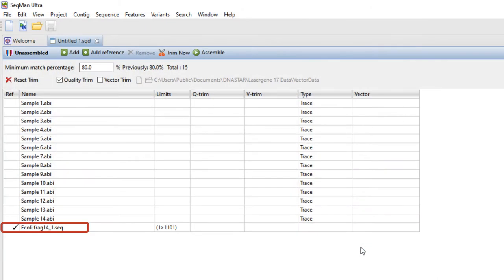Note the check mark in the Ref column, denoting that the sequence has been correctly entered as the reference.